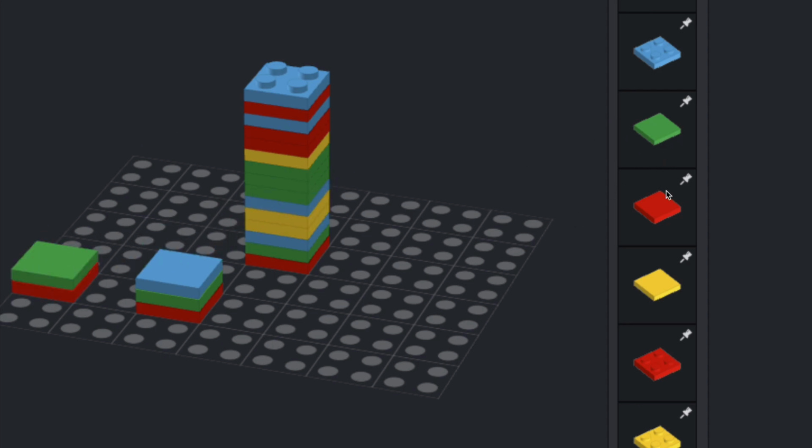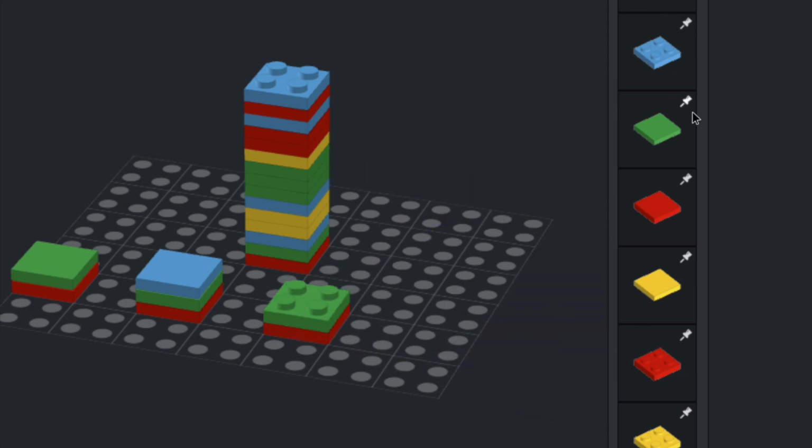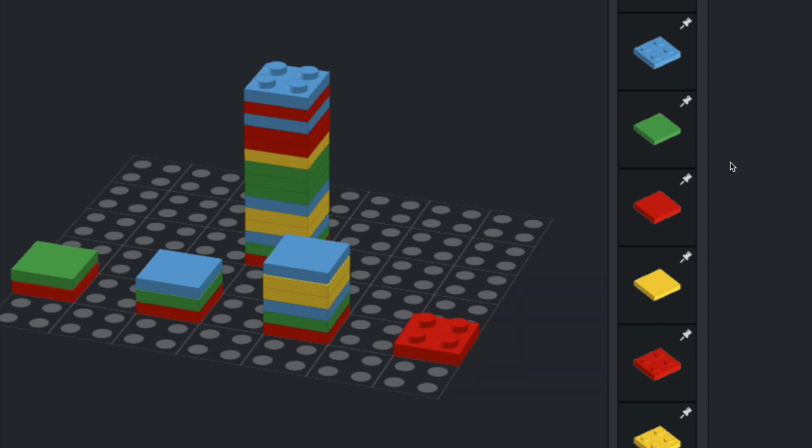And if it gets a dNTP, it continues adding on more and more nucleotides to the newly generated DNA strand. And if it gets a ddNTP, without essentially the studs like on a Lego block, you just can't build any further on from that. And so you see here, as we're going through, we're generating all of these new fragments of DNA at various lengths.